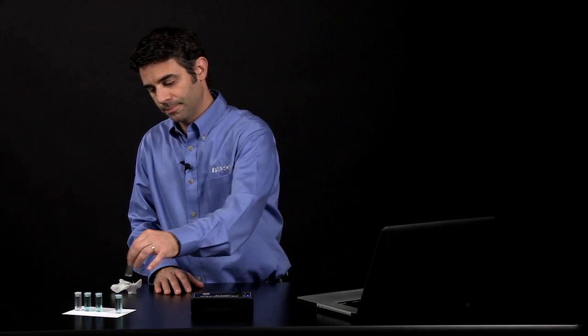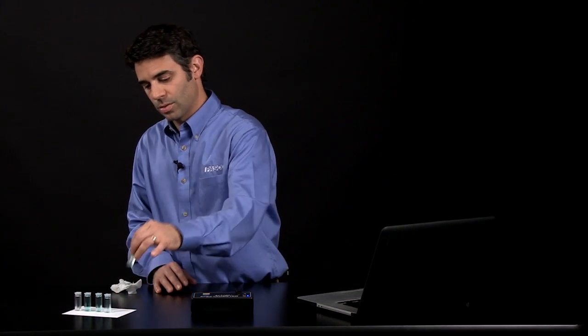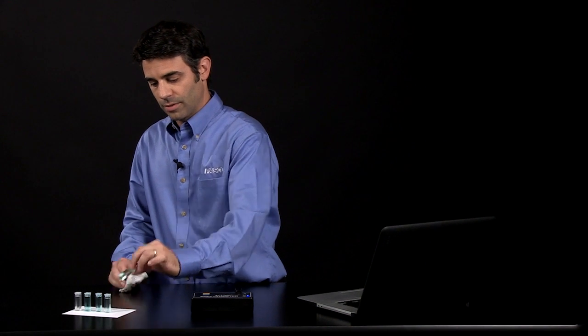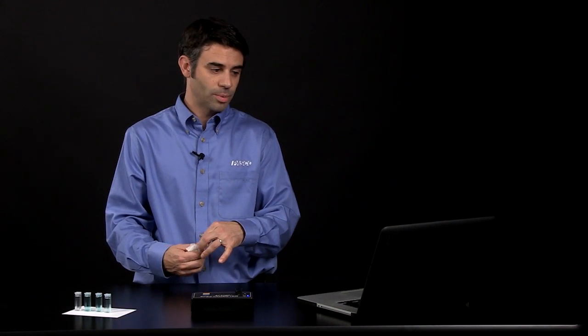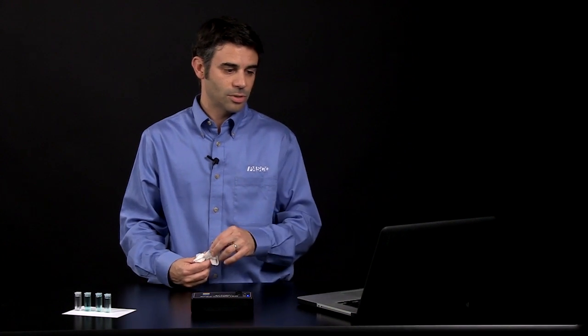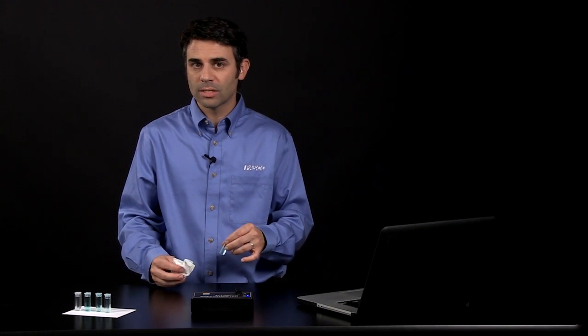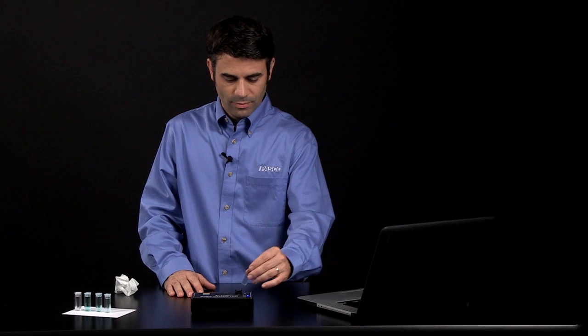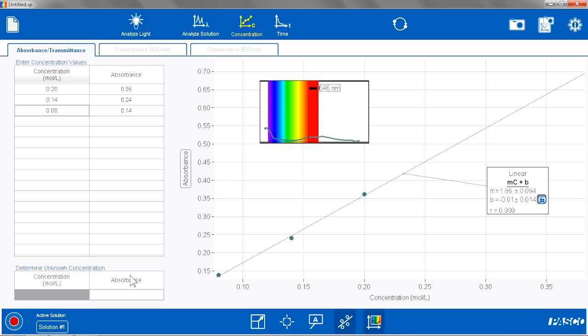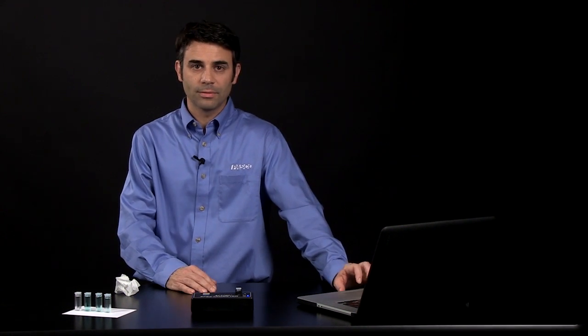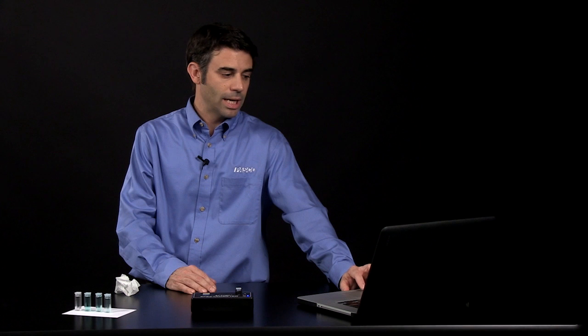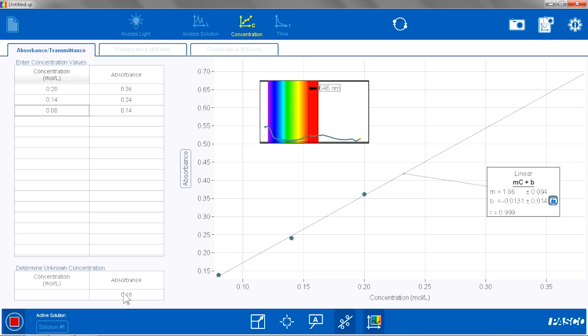Now that I have calibrated my standards, I can determine the concentration of an unknown based on its absorbance and the information that I have. This is where the software incorporates some pedagogy. If I put my standard in and go down to my unknown concentration portion of this page, I click on absorbance and hit Start. Now it is going to measure the absorbance of the unknown. I am going to hit Keep. It does not tell the student what the value of the concentration is. It does not put it on the graph, but you can put it on the graph. The student has to figure it out first.